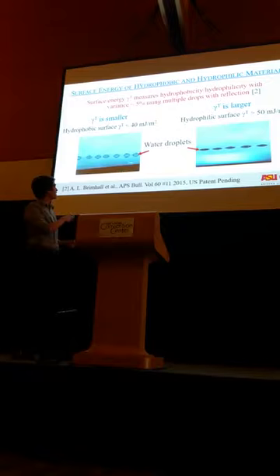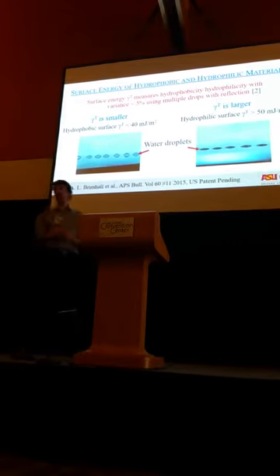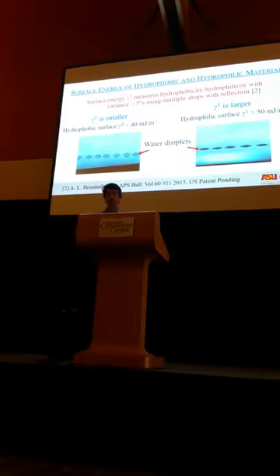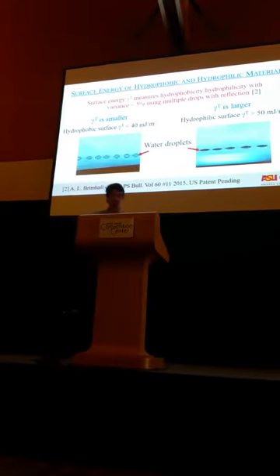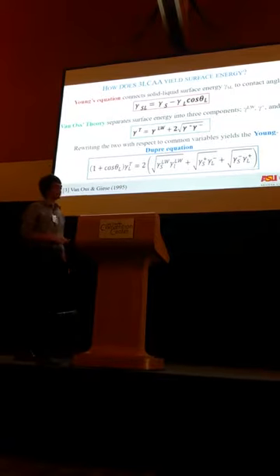So in this way, we see that hydrophobic surfaces tend to have a lower surface energy, and this results in a rounded droplet, while hydrophilic surfaces tend to have larger energies, and this results in a much more flattened droplet. So in this way, 3LCAA allows us to measure both the surface energy of a material and the hydrophilicity of that material. So how does measurement of the liquid contact angle result in a value of surface energy?